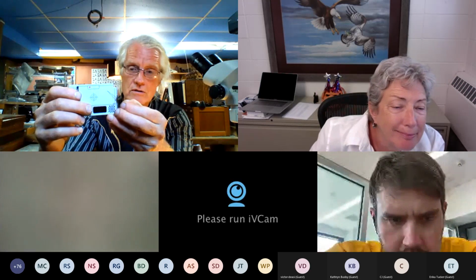can just hold the bee in front of it, okay? And then I usually will put the butt end or the head end on one of the major diacritical marks, like an even millimeter, like 10 millimeters. And then I will look at the hind end and look at where the millimeter mark matches up on that.